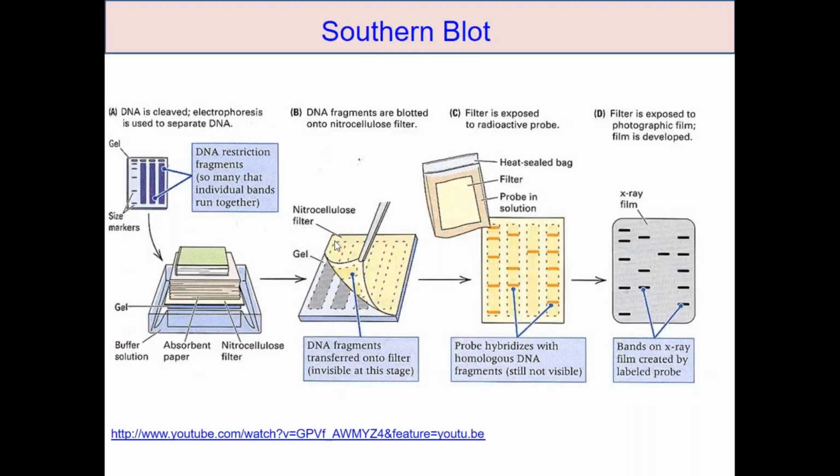Don't get confused. So those who have not performed Southern blot, let me show you a picture.